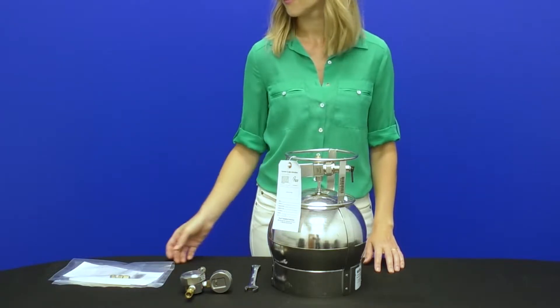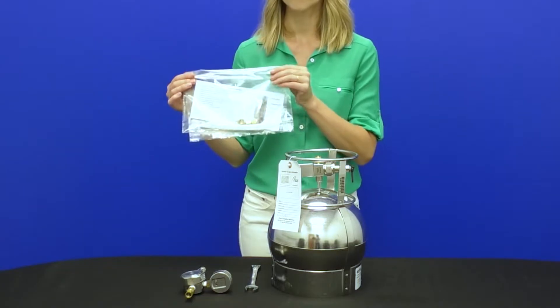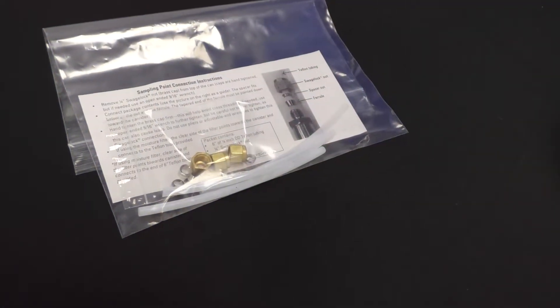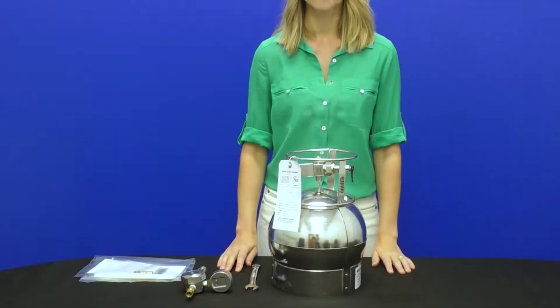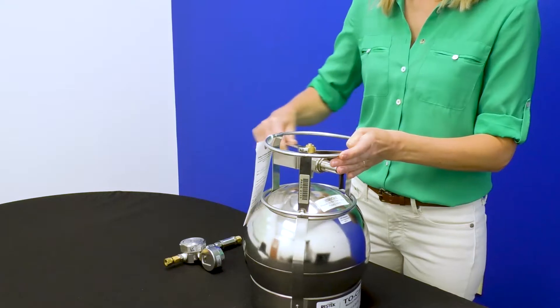If tubing and fittings are needed to sample a subsurface or hard-to-reach area, you will find these items and all instructions in an enclosed plastic bag. Next, verify the valve is securely closed and remove the brass cap from the top of the valve.